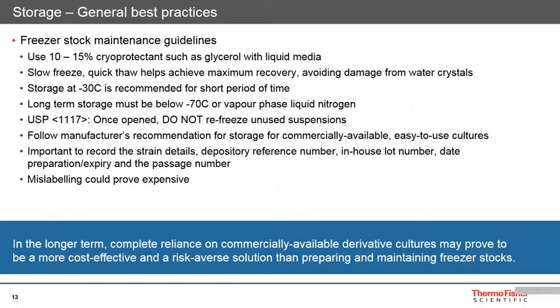Also, you would need to be careful on recording data, labeling, and temperature maintenance. Any mistakes around QC organisms for a long-term study could prove an expensive mistake. Overall, our suggestion is that in the longer term, complete reliance on commercially available derivative cultures may prove to be a more cost-effective and risk-averse solution than preparing and maintaining freezer stocks.